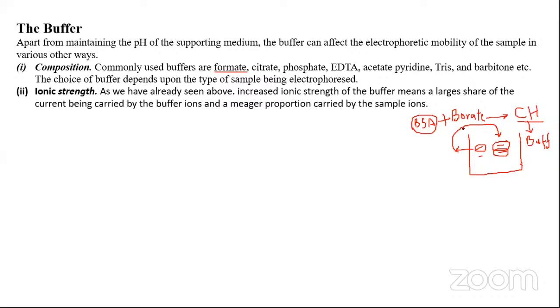Obviously, one thing, Bhavika, has to be very clear in your mind. Whenever you are choosing any component for formation of a buffer, that essentially should be a molecule which doesn't liberate protons very easily. That means it should be a very weak acid. Then only it can work better for you. Does that make sense? Yes, sir, but in case of borate, it doesn't release its H plus in any condition.